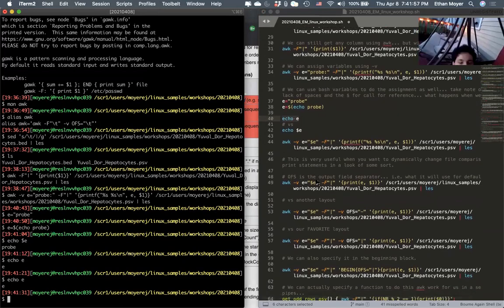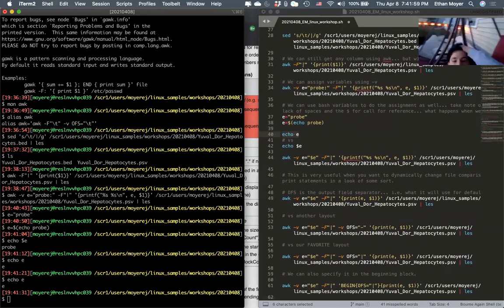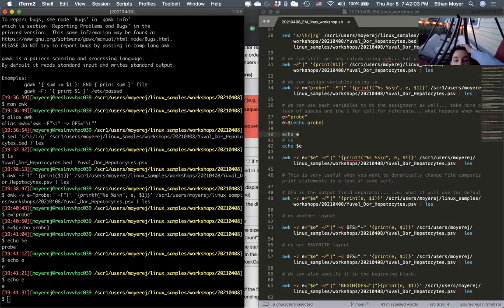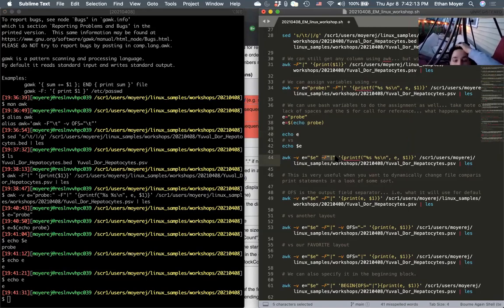Okay. All right, I have a question. Okay. So awk dash capital F, and you did the pipe, what's the default setting for reading the files? Would it be able to recognize a TSV file, or would you have to specify \t?